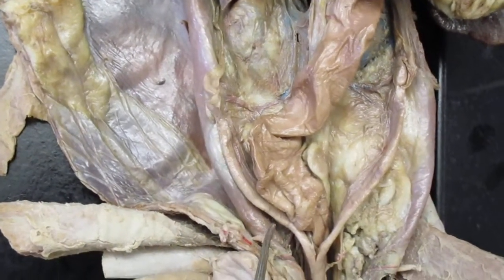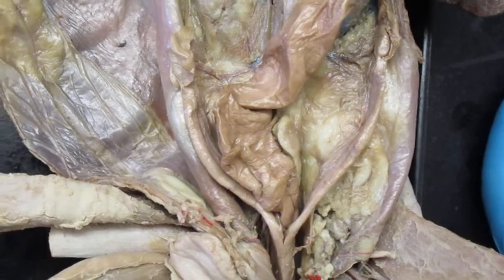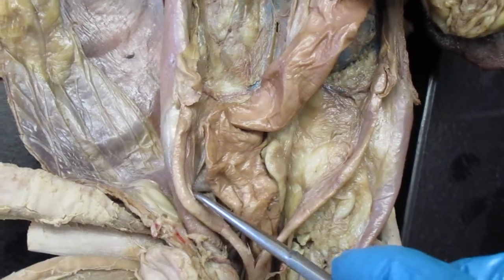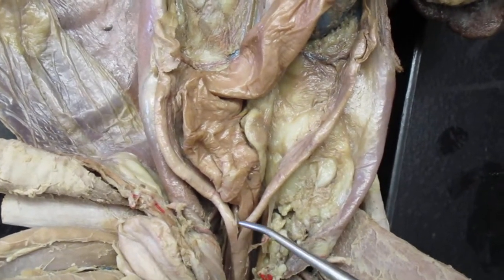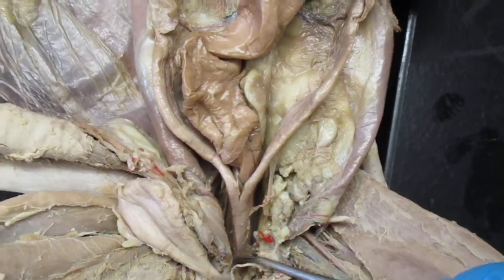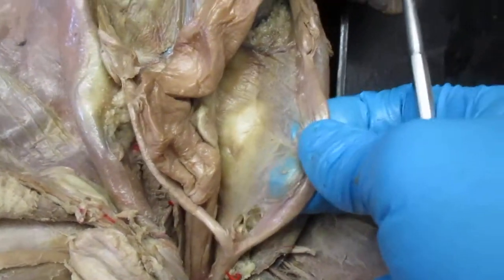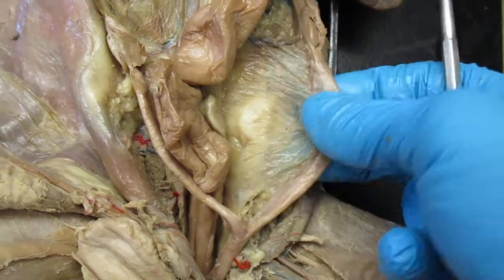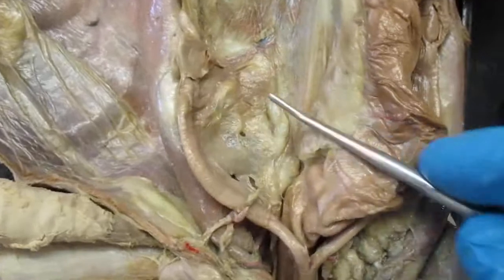Now, you notice that with the cat, the uterus is bifurcated. So here's a right uterine horn here, and then the left uterine horn here. And here we see the body of the uterus right in here, and then it's going to go down into the vagina right here. So another thing I want to point out to you is the broad ligament. That's this clear looking stuff right here. That's the broad ligament, and you can see the broad ligament right here.